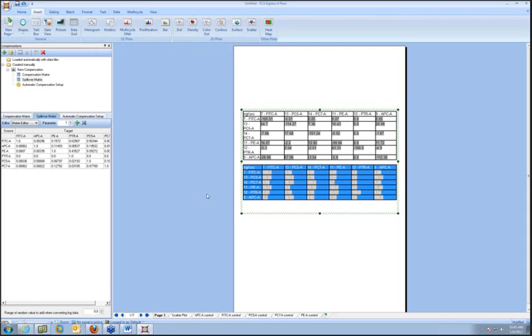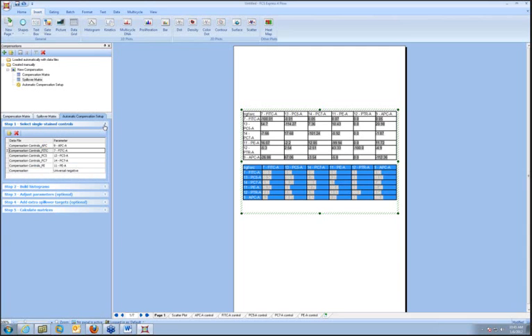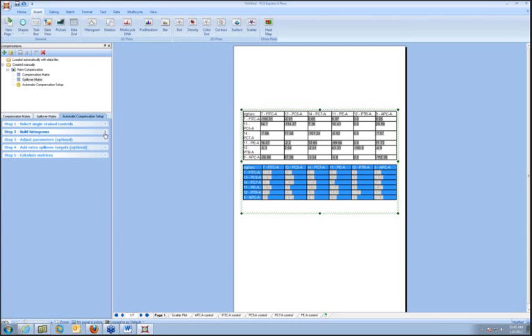But the very basics of, just to recap, picking your single stain controls and assigning them to a parameter, building your histograms, and then calculating the matrices is very, very straightforward and much, much quicker than it was previously. Again, all of this functionality is detailed both in the tutorials and in the FCS Express manual itself.